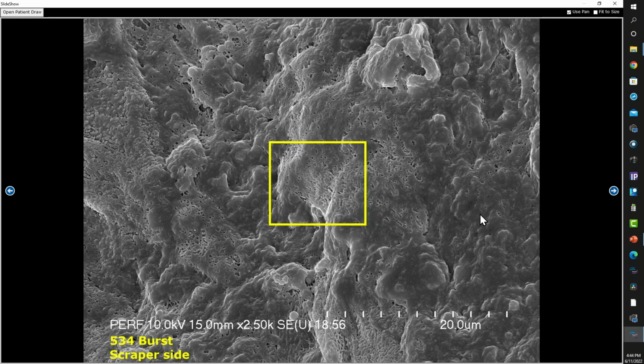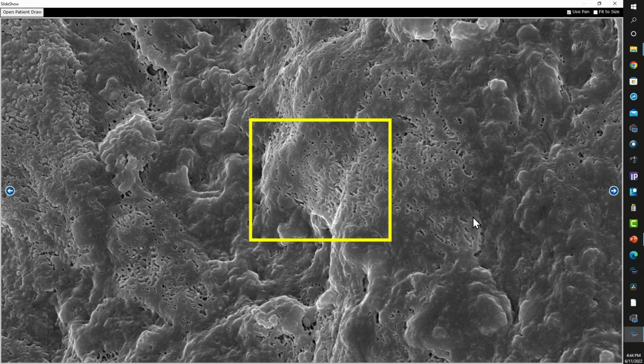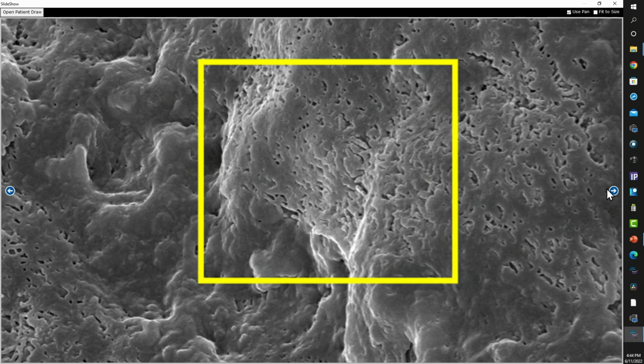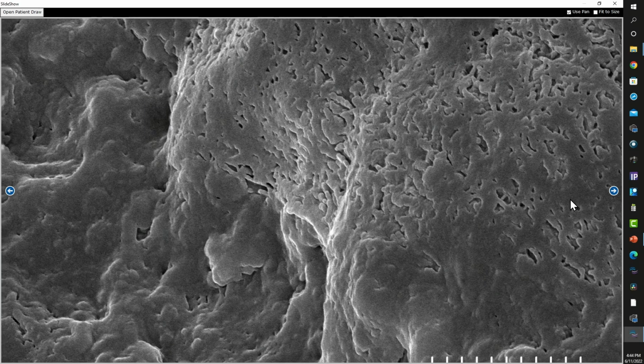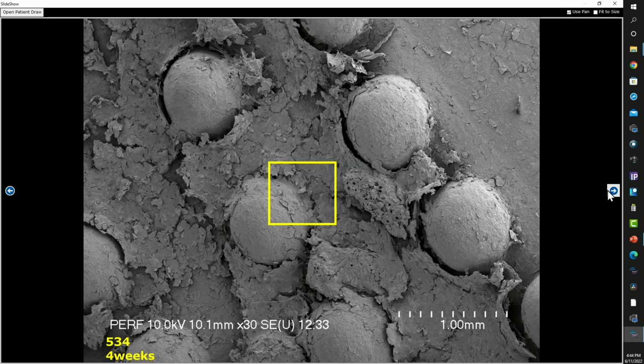Hard to make out any singular organism, but when you go in and really look around, you can see how these form as a community. And the toothbrush is basically just simply covered with a massive biofilm, although looking at it with the naked eye, you'd never know it.